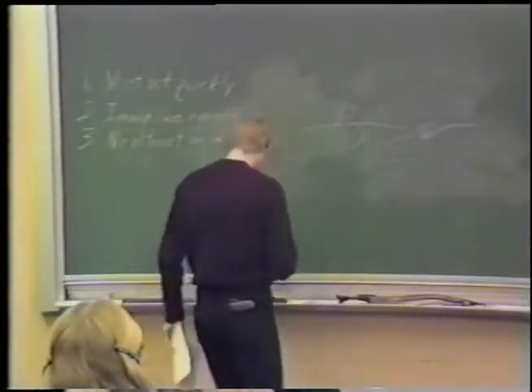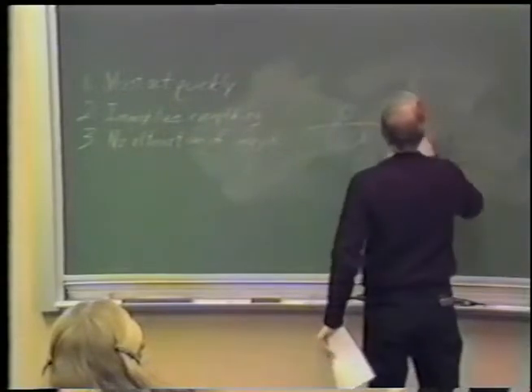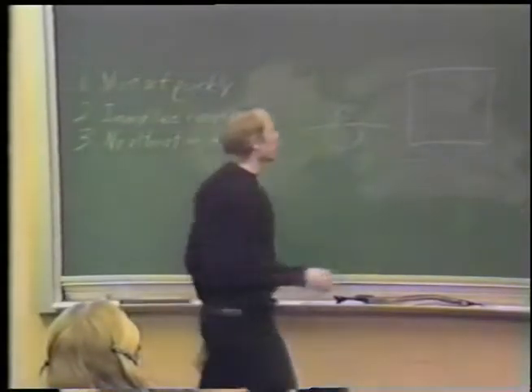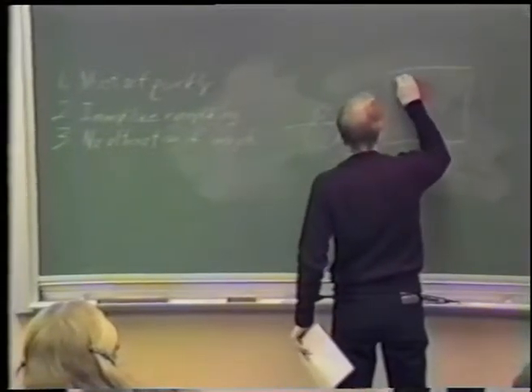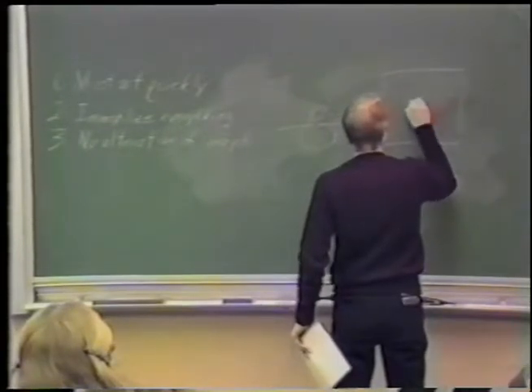We'll have a slide of that. You're all familiar with freeze fracture images, nomenclature and such. Okay. Say that one were to freeze and fracture a cell, a natural experiment. You're going to see a certain distribution of intramembrane particles.